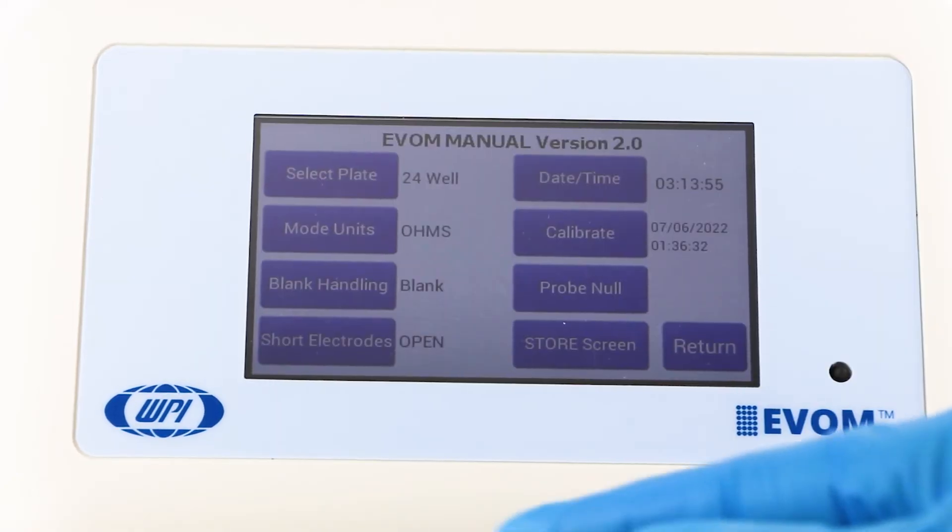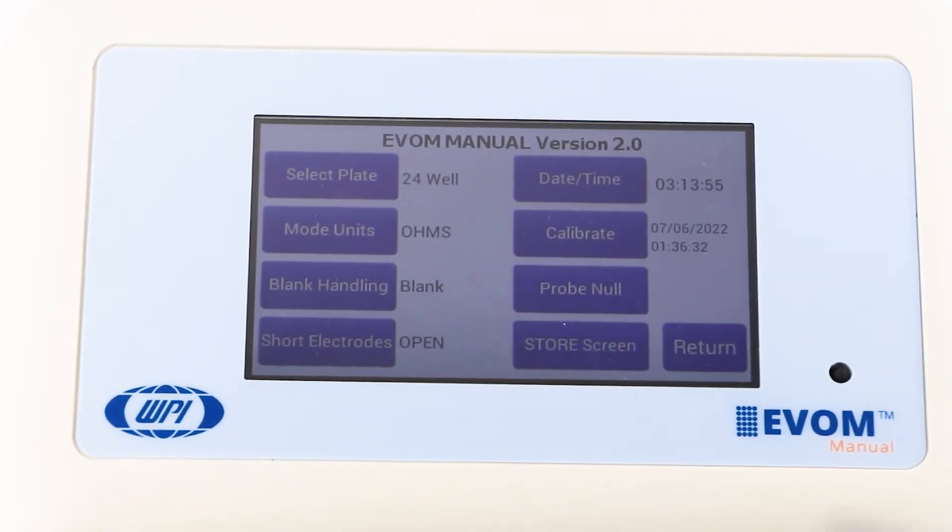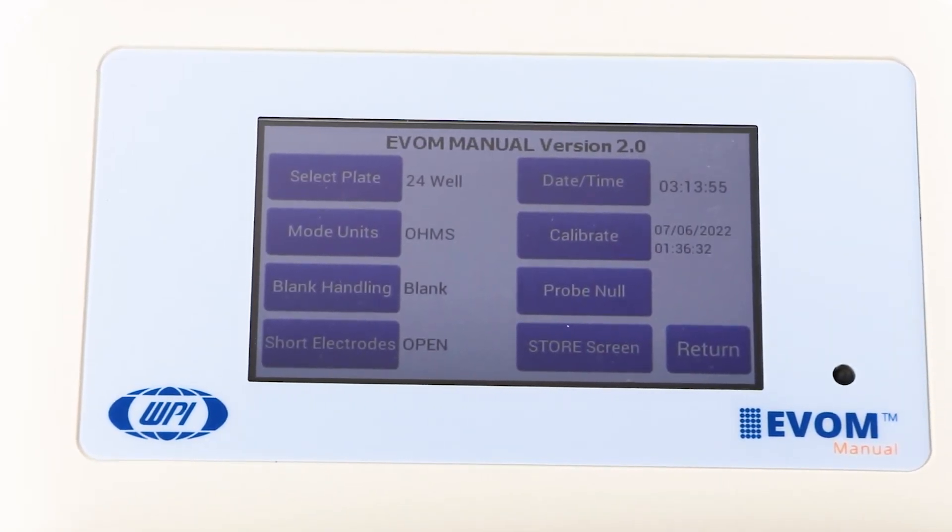You may press calibrate to calibrate the meter, since the meter uses an internal resistance to adjust the internal measurement electronics.